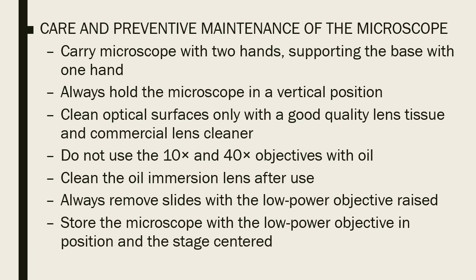You clean the oil immersion lens after use, because you don't want the oil to get stuck in your objective lens. Always remove slides with your low power objective raised, and store the microscope with your low power objective in position and the stage centered.